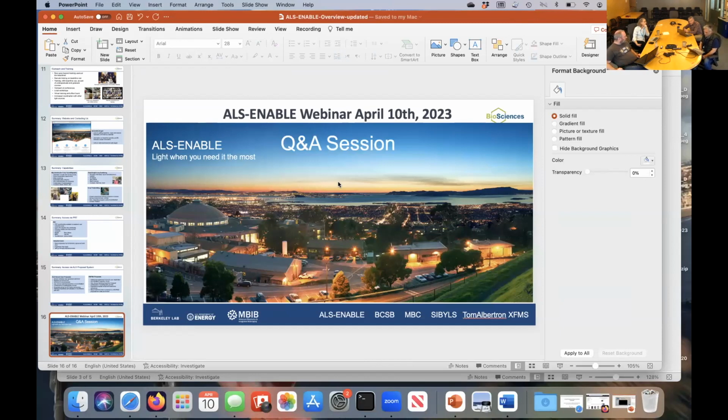I could add that at this point in time, the subscription ratio would be a little bit biased because a lot of those beamlines have been upgraded with detectors and now they are performing to the level of all the other beamlines. So I think that's a good thing at this point.